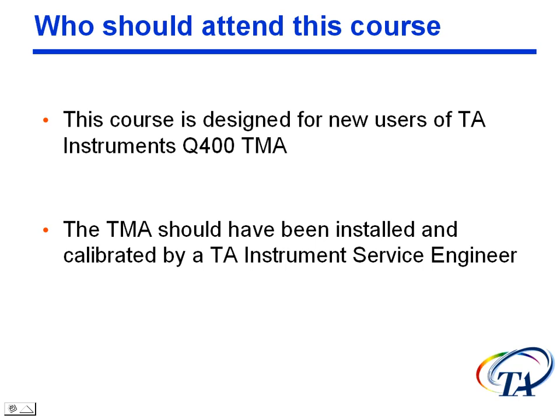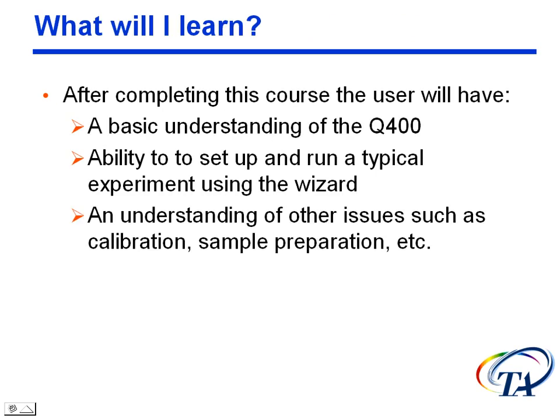Actually, I've already talked about this, but the course is designed for new users of the Q400. If you've used the instrument for a while, it doesn't mean that you can't take this course. It just means that the course is pretty basic, so it may not gain you as much as if you're a new user. Okay? Now, after completing this course, what we want you to have out of this is a basic understanding of the Q400, the ability to set up and run a typical experiment using the wizard, and an understanding of other issues such as calibration, sample preparation, etc.